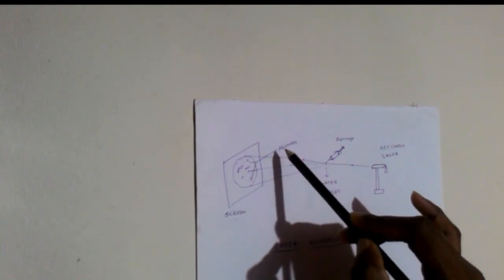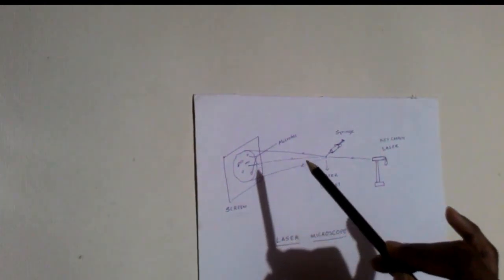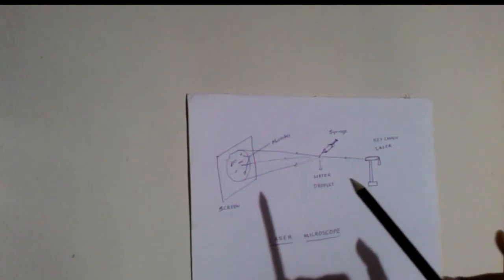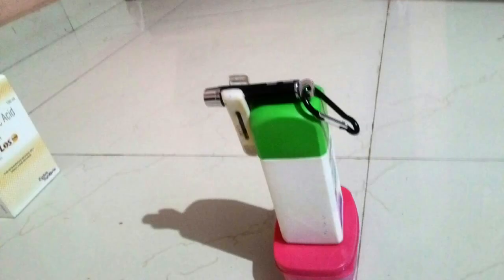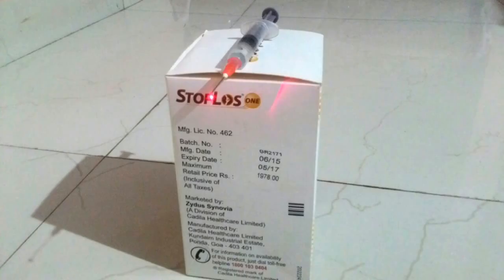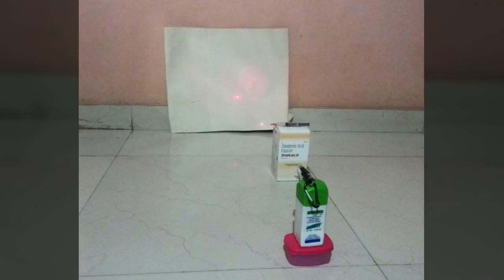So we can view the tiny microbes, very small microorganisms in the water, so that we can check the purity of the water. This is how it works.